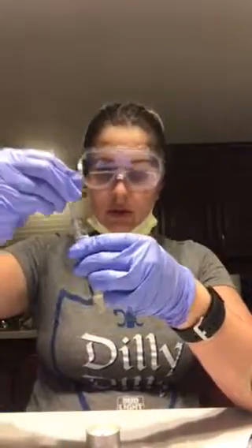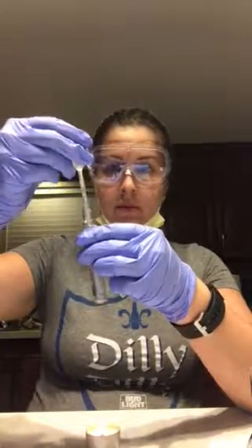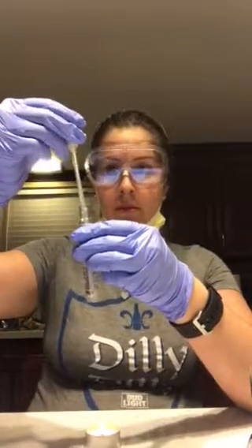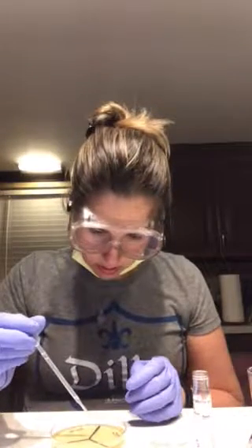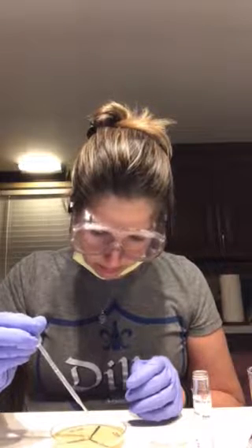We'll take all the alcohol off of the pipette and then we need to get 0.5 ml of the broth. We're gonna add eight drops of the broth to the center of the agar plate — so one, two, three, four, five, six, seven, eight.